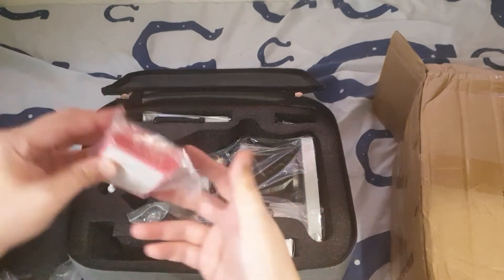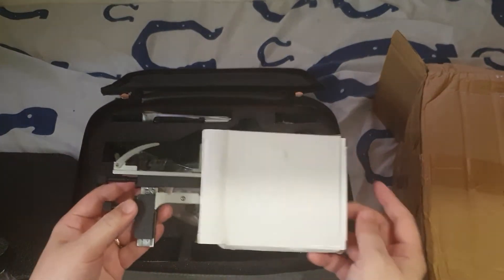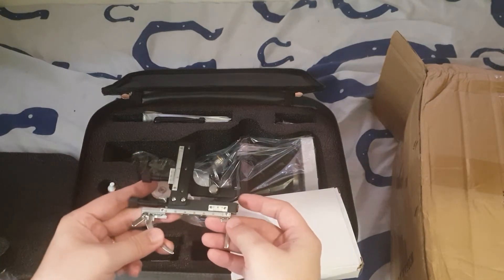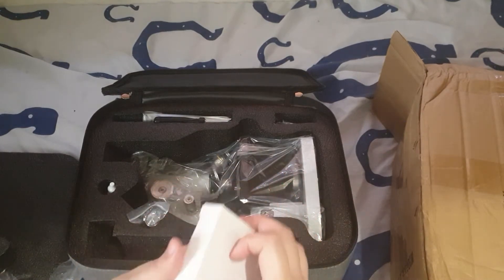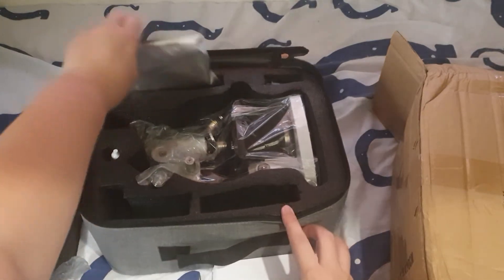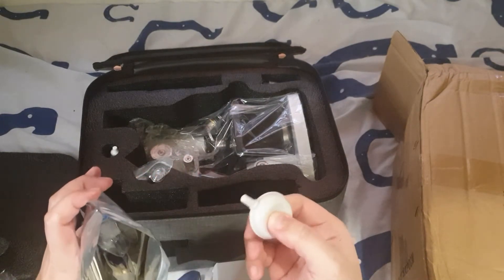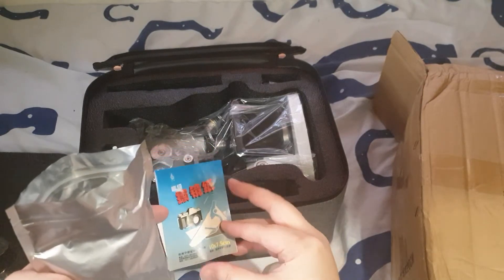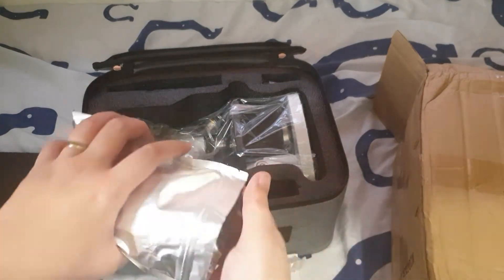You've got a set of slides. What is this? Oh — so this is the stage; this is where you put the slides and move them along the microscope. You've also got a small screwdriver. And there's a cleaning kit — a microscope kit. It's got pieces for specimen, some notes, swabs. So it's basically a small science kit.